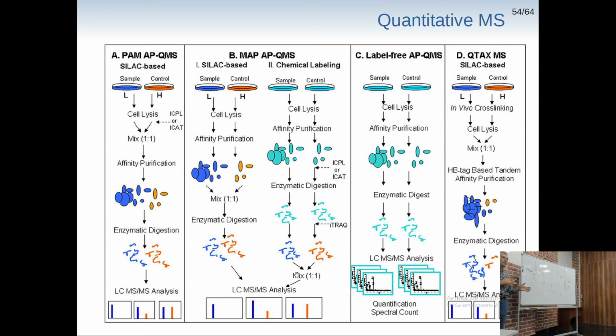For data-dependent acquisition, it's obvious. Data-dependent acquisition will ruin our quantitative approach. With data-independent acquisition, what can happen? Different time. Probably, but the error will be small because we'll try to model the distribution as a bell curve. Even if we have only 3 points, we can fit our bell distribution with these 3 points, so it's not a big problem. Though it is a problem, but not a big one.